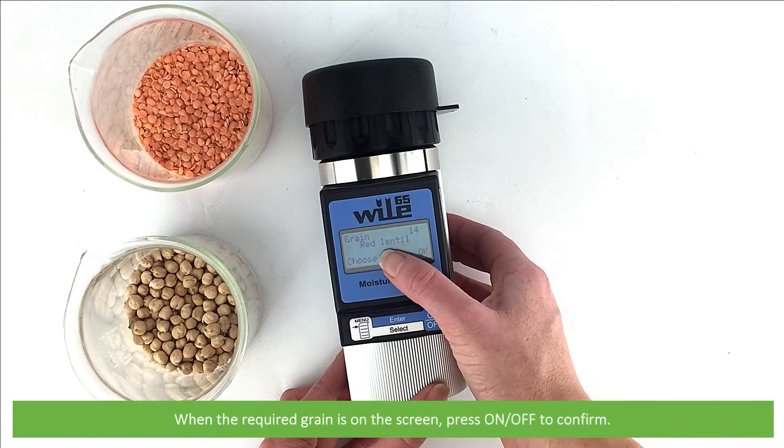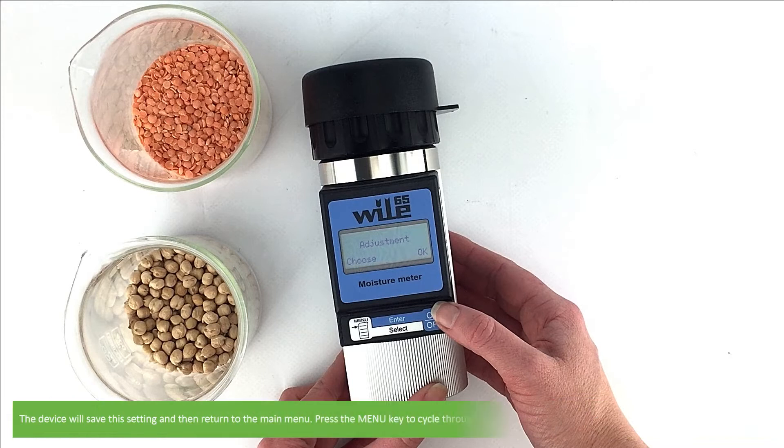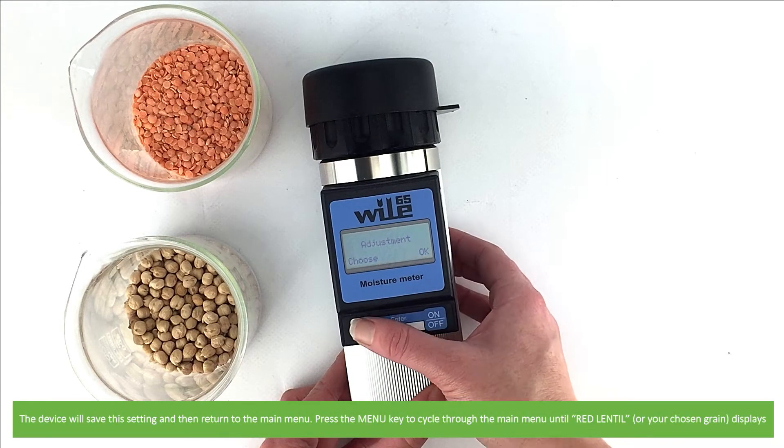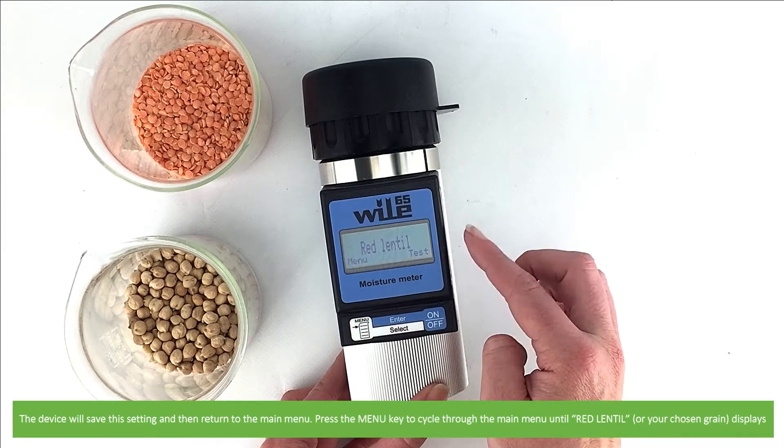When the required grain is on the screen, press on/off to confirm. The device will save the setting and return to the main menu. Then press menu to cycle through the main menu until red lentil or your chosen grain displays.